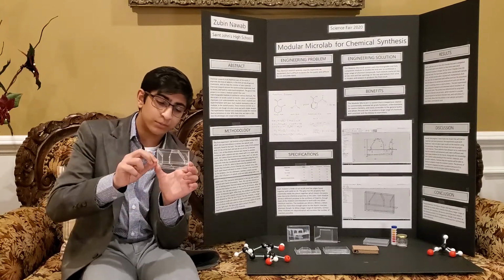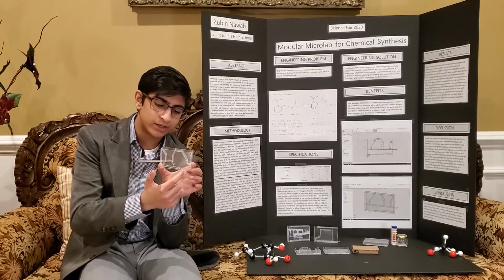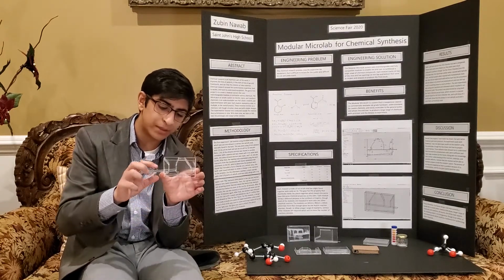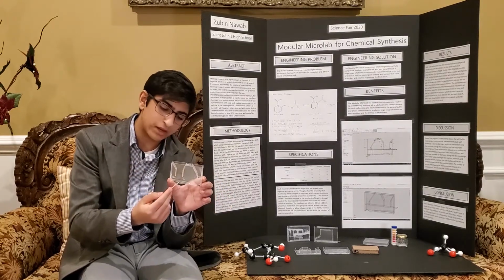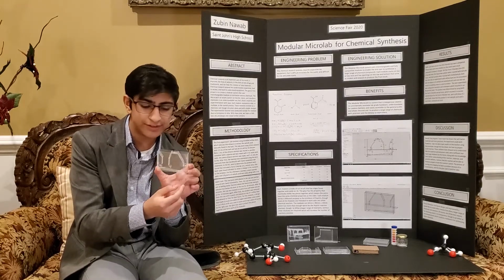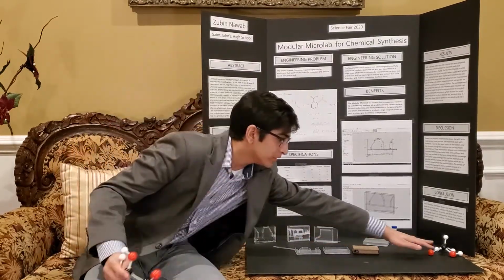So you can pull this, and first of all, the salicylic acid, which is a powder, drops down in here. It's directly above it, so it should go directly down. And then after that, the acetic acid, once you pull it all the way out, goes down, and it should wash the salicylic acid down.